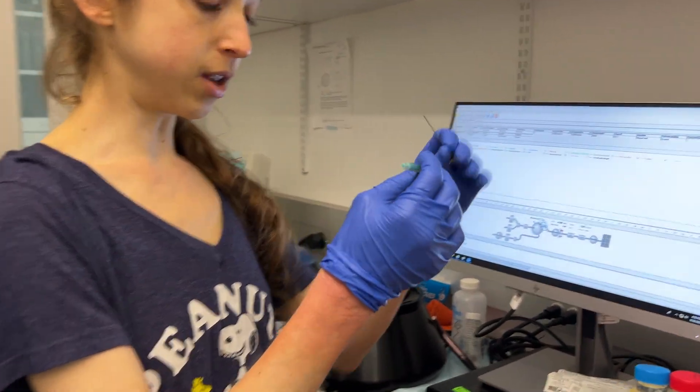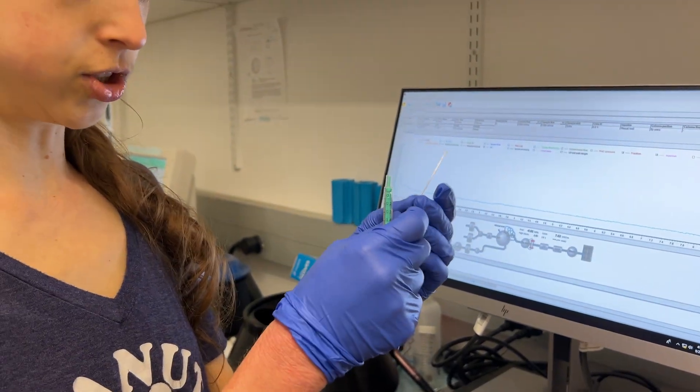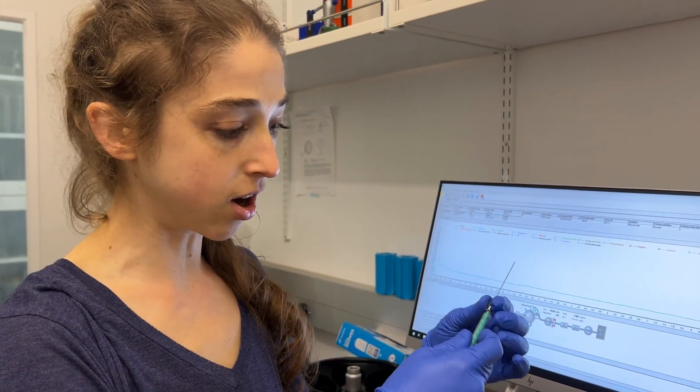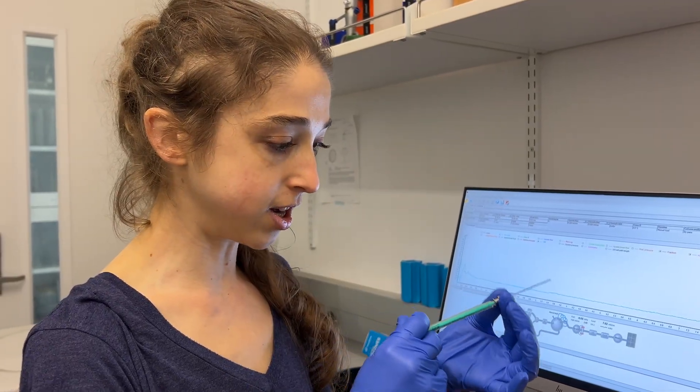This is just a reusable syringe. You can also use a Hamilton syringe — in that case, you wouldn't be putting any of these in. If you have a bigger size one, you can actually have twist-on things. But when you have this one-mil syringe, you just push it in here.